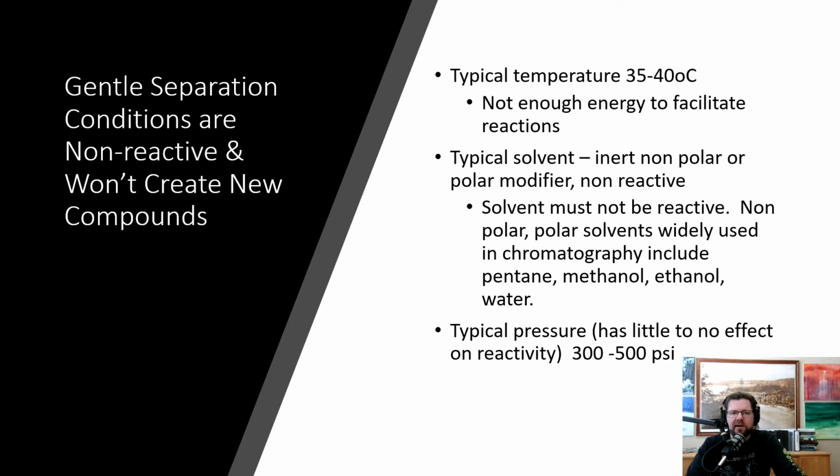Typical solvents are nonpolar or polar modifiers. They're non-reactive. In fact, the solvent must be selected to be non-reactive. There's no reason to have a reactive solvent. They'll include pentane, methanol, ethanol, water, and heptane, for example, might be another good typical solvent.